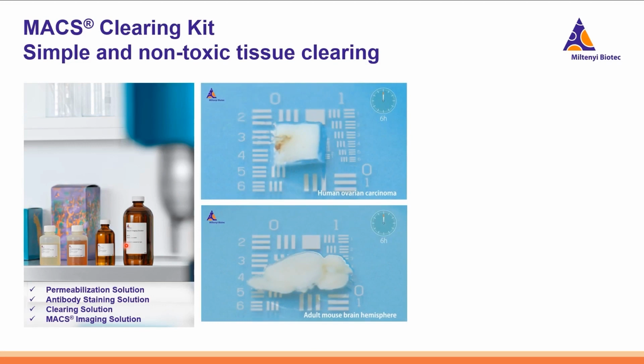Here is a real example of how the tissue clearing works here. So you can see human ovarian carcinoma on top, and on bottom we see the adult mouse brain hemisphere, and in the course of 6 hours both of them are becoming clear, and you can see the sign below the tissue.